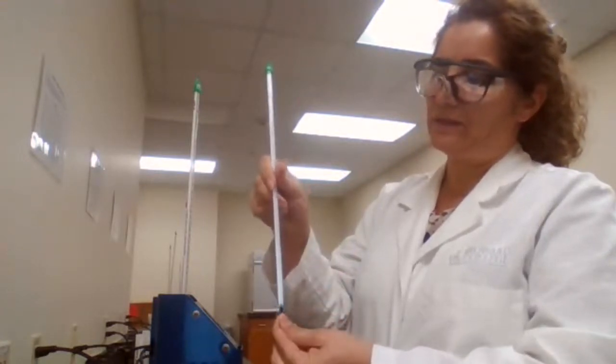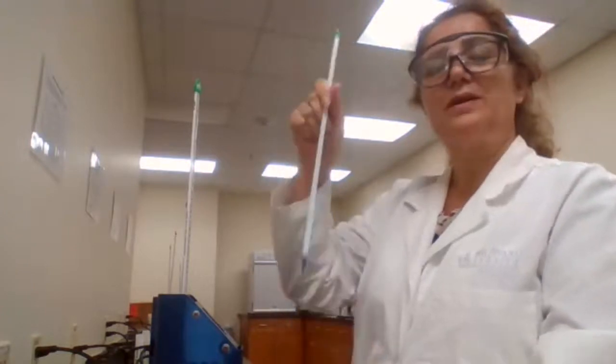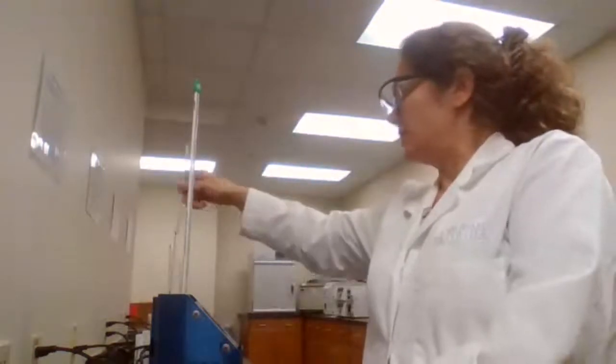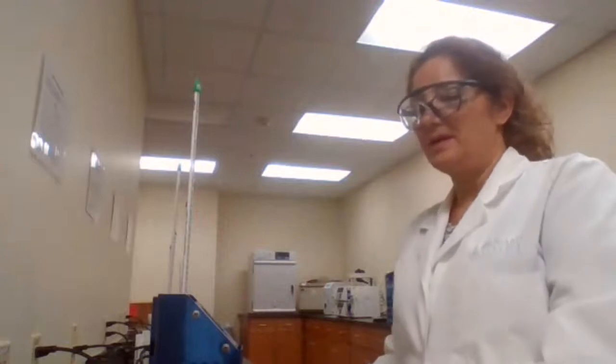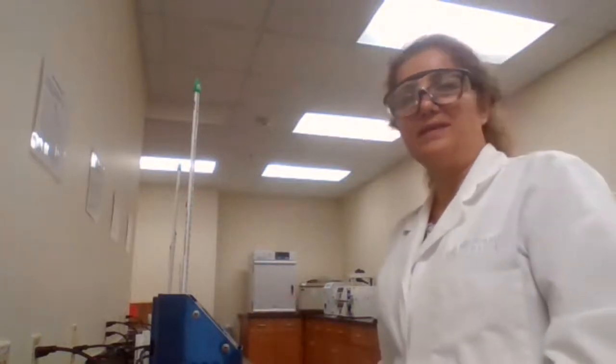And to better test or calibrate this, you can place it in pure, boiling water. If it shows 100 degrees at sea level, then your thermometer is calibrated. If it's sea level and this one shows 95 degrees, that means it's 5 degrees off.